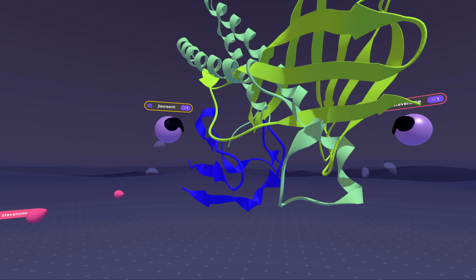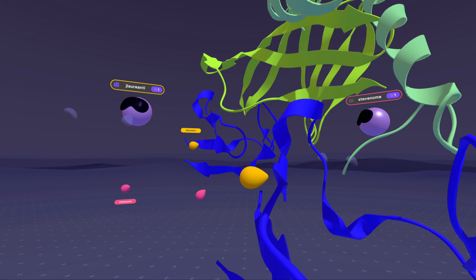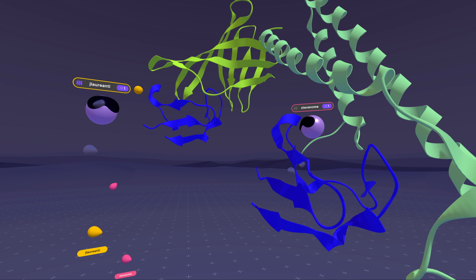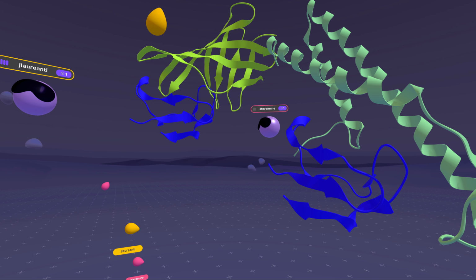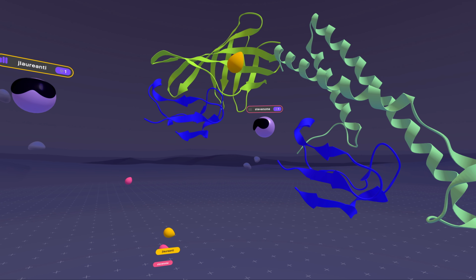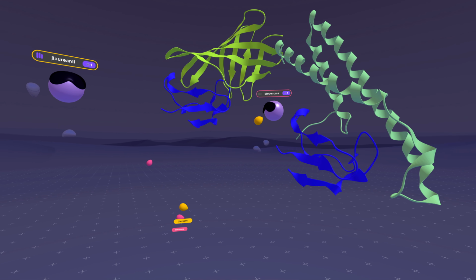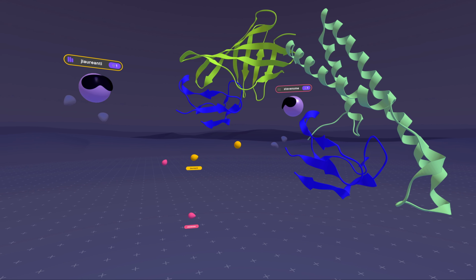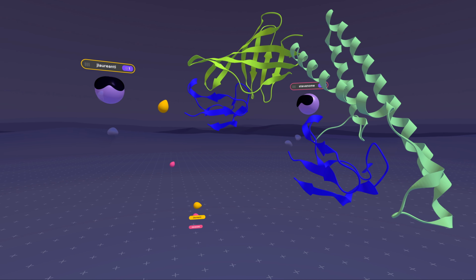With Nanome V2, we can just grab one of these and move them, so we can see how the beta barrel will interact with this protein compared to how the alpha helix will interact as well. We can realign these later to look at them as well, but I just wanted to join the space with those proteins in the same spot to begin with.